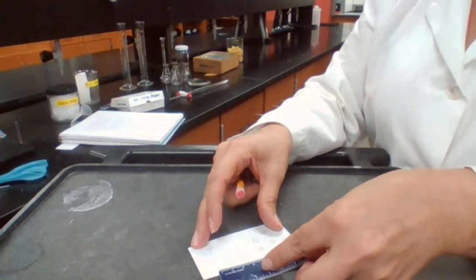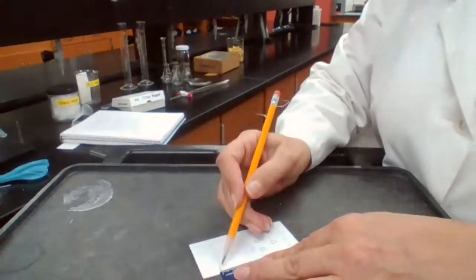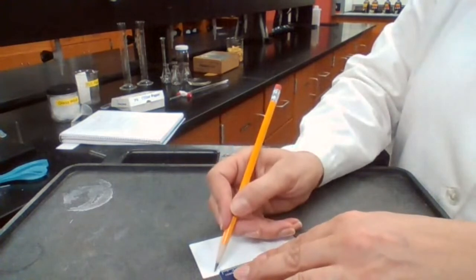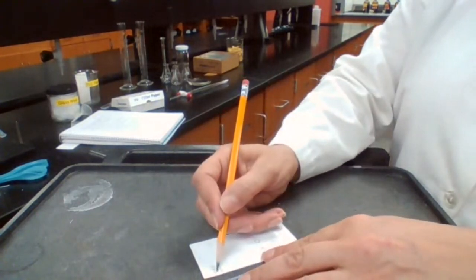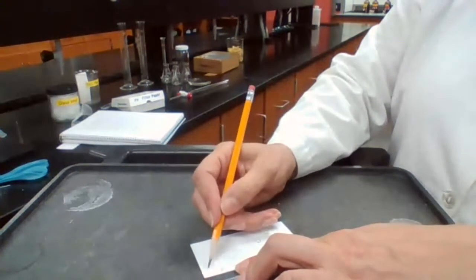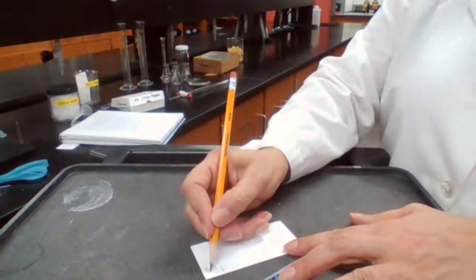the distance traveled. I'm going to have to measure it. I don't know it, so just give me time. The distance is 7.20. So 7.20, that is the distance traveled by the solvent.